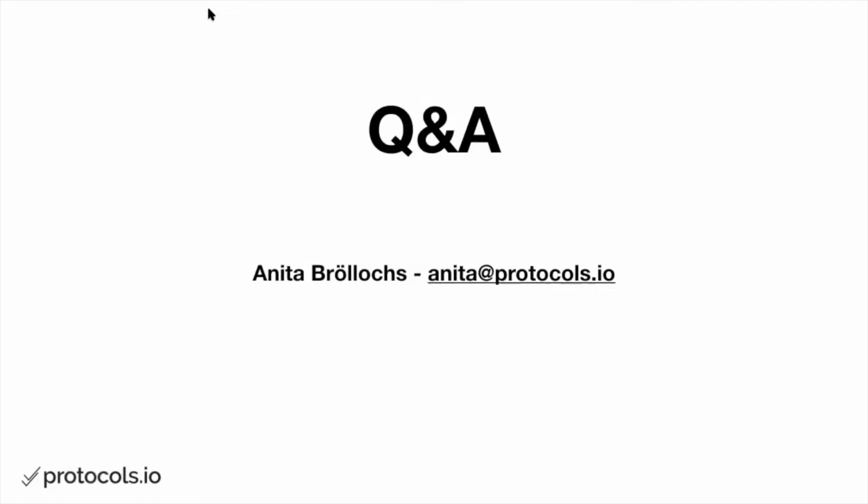Any other questions by anybody? How do you make tables in protocols?